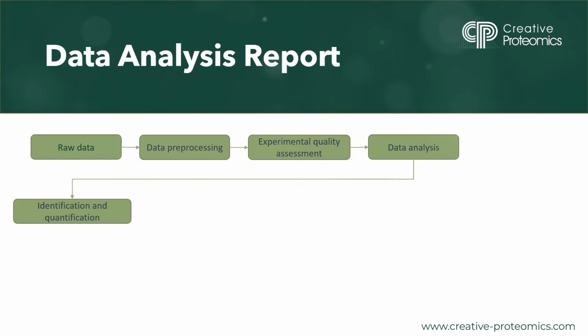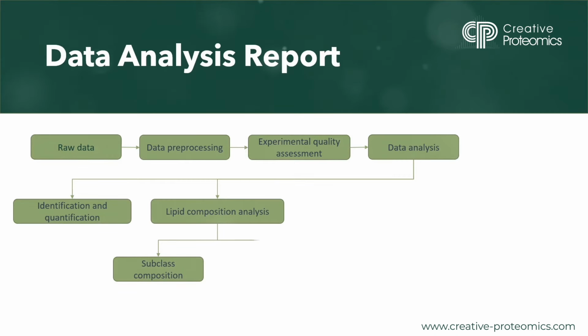We explore the composition of lipids within our samples. We analyze the distribution of lipids across subclasses, such as phospholipids, glycerolipids, and sphingolipids. This helps us understand the diversity and complexity of lipid profiles and their metabolic pathways.